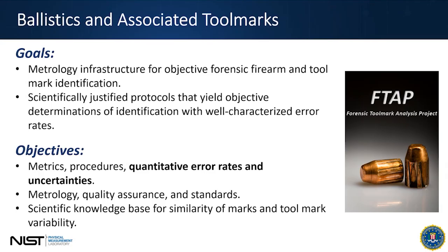And NIST as a whole, all we do is really measure things and measure them really accurately. So we're trying to apply some of those methods and techniques that we've employed in all of these other arenas to try to focus it on firearms and toolmark analysis to be able to elevate and raise the bar for measurements in this realm. And of course, our other objectives are to try to come up with that metric. And to get to that metric of similarity and be able to put numbers on how good a match is, we need to be able to take repeatable measurements.